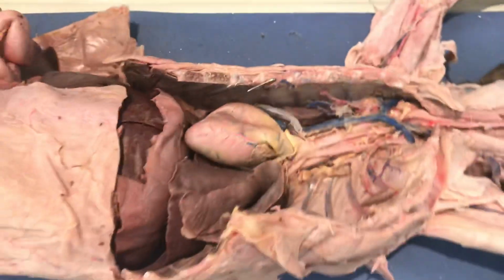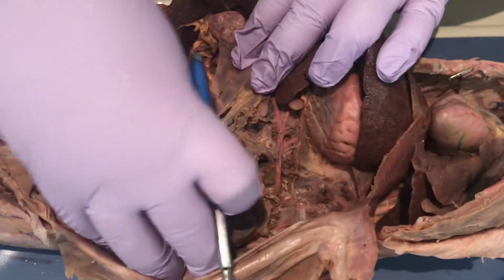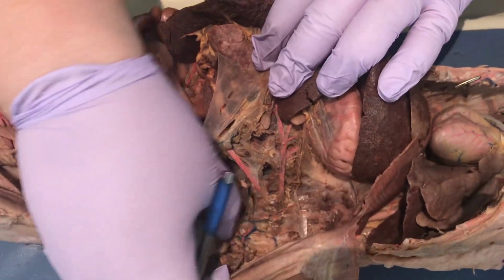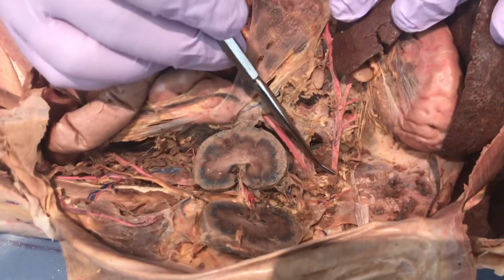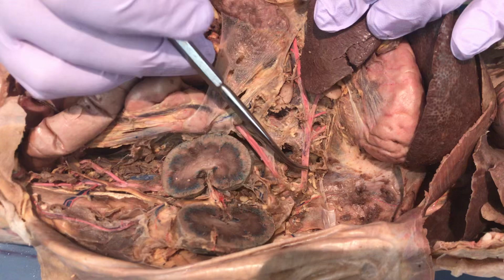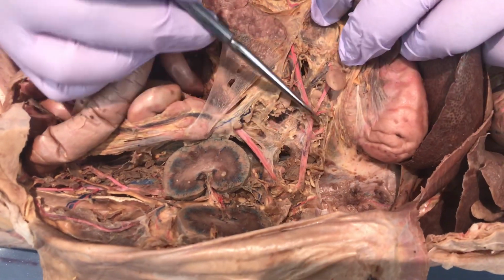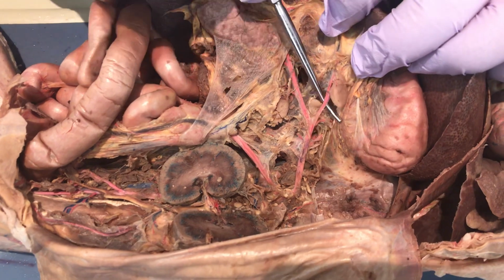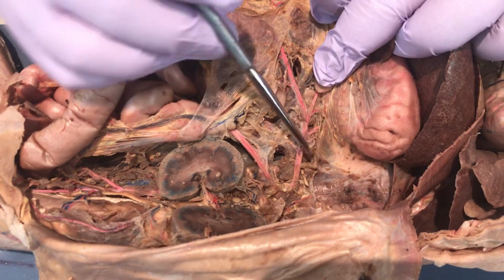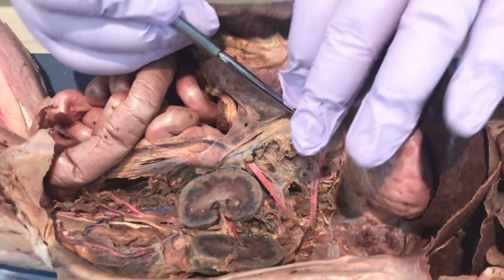All right, moving into the abdomen. I apologize, my abdomen's not the best abdomen, but it'll do. This first branch off of the main abdominal aorta there is the celiac artery. The celiac artery branches into gastric, hepatic, somewhere in there, hepatic, there it is, hepatic, and then splenic, going towards the spleen.